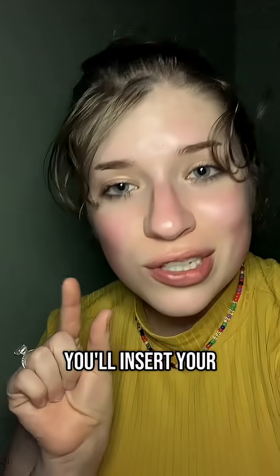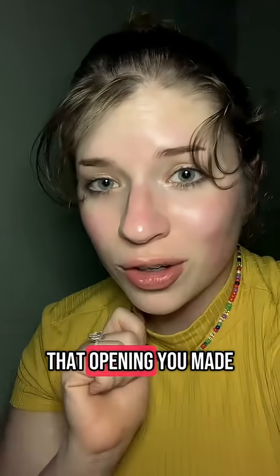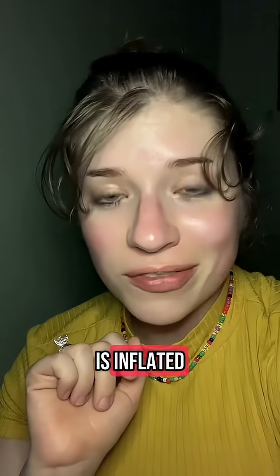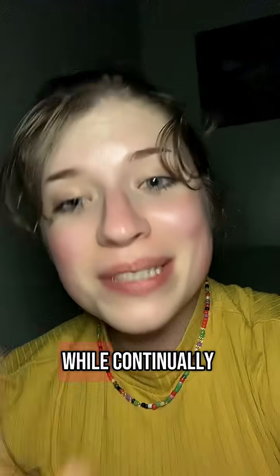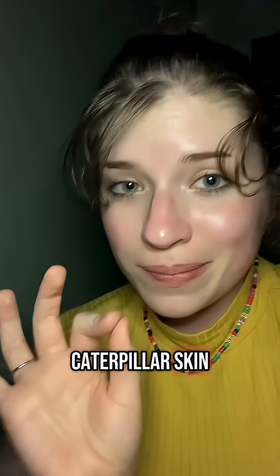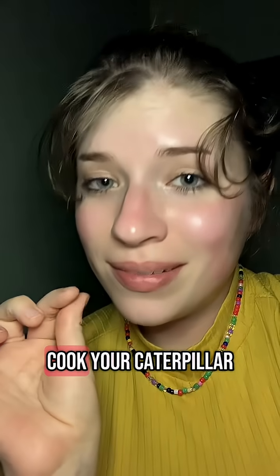Once the guts of your caterpillar are fully removed, insert your tiny straw into the opening you made and gently blow until your caterpillar is inflated. Now comes your heat source — while continually blowing into your caterpillar skin, you're going to cook your caterpillar.